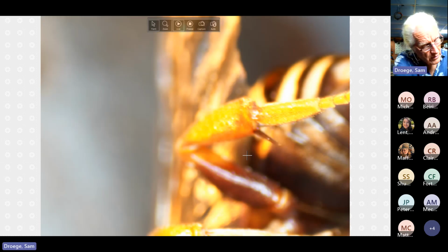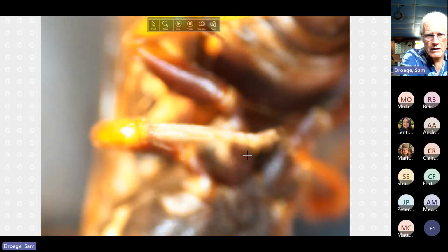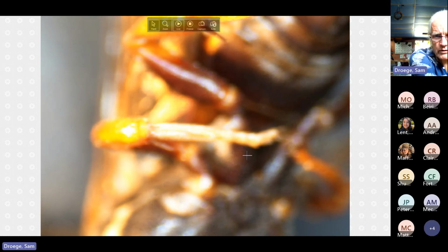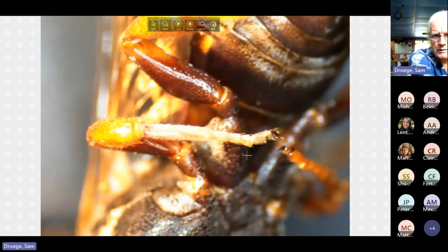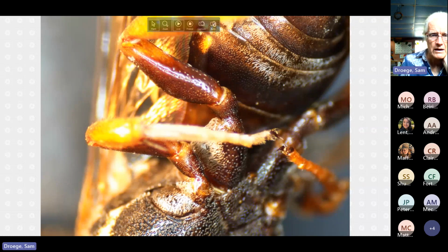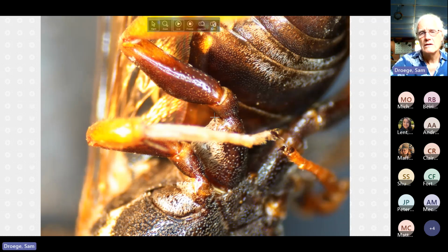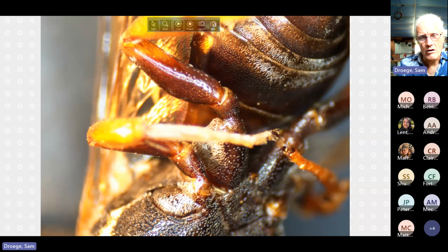So I believe 2 and 3 have white hair bands largely. Remember, we're talking about the apical fourth, so basically near the rim, but probably not right on the rim, as is illustrated here. So unlike the appressed hairs up here and on the rest of the body, these are usually not as, shall we say, dense and obvious. Why they're here at all, I have no idea.